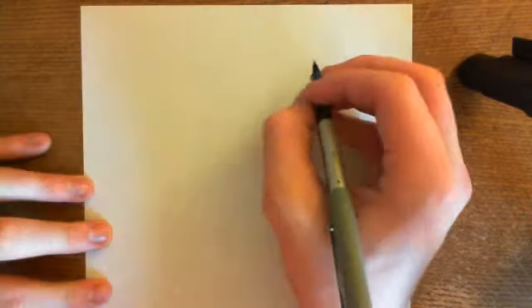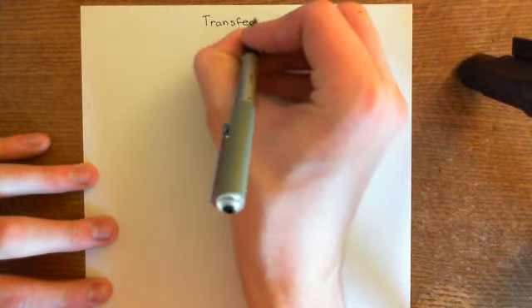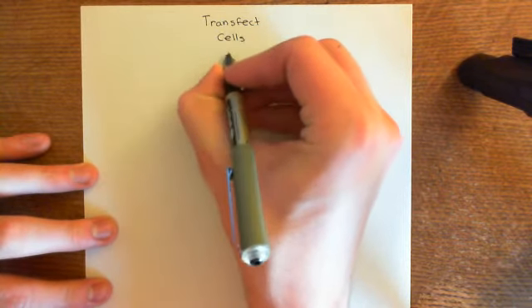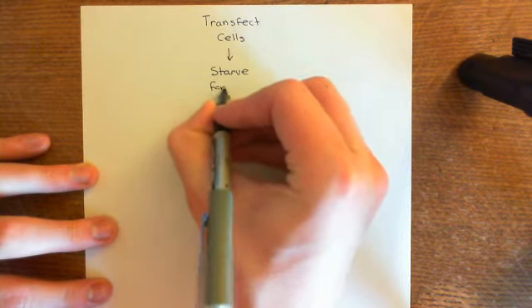Okay, so the experimental procedure then, we've started with transfect the cells. So we're adding in an extra copy of the gene, so the cells will all be making much more of the protein. So transfect the cells is step 1. The next step is going to be to starve the cells, and we're going to do this for 1 hour.